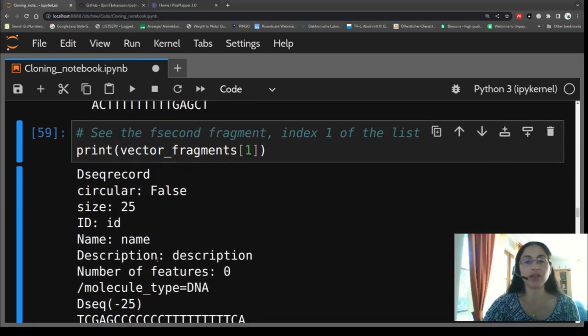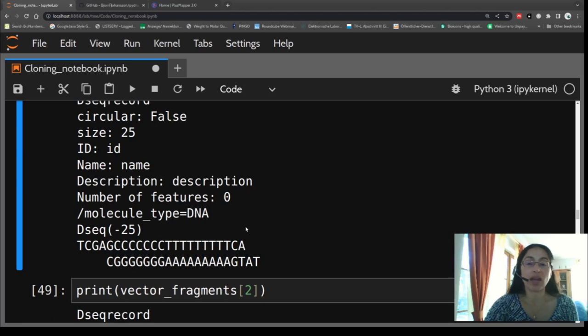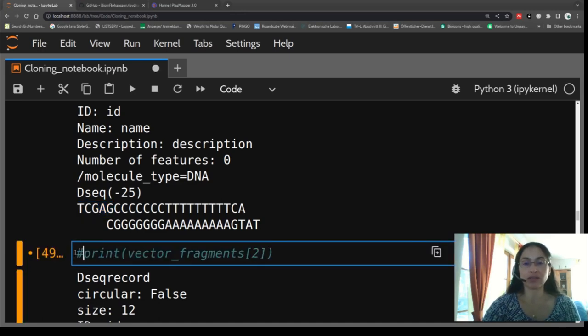We have a 25. So if we think about it, the little one is kind of like my X gene, the simulated gene, and then the rest is what I call the skeleton of the vector, and that has the hanging pieces. This is the NdeI, and this is the XhoI. For some reason, it's upside down, in my opinion. And then, yeah, we don't have a vector 3. That's for the other version.